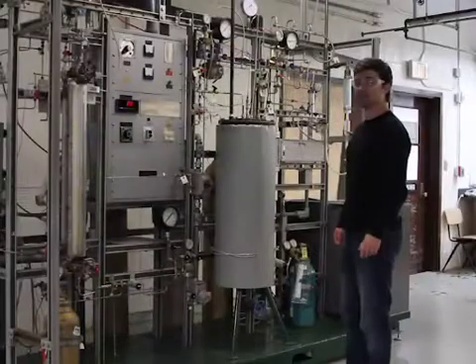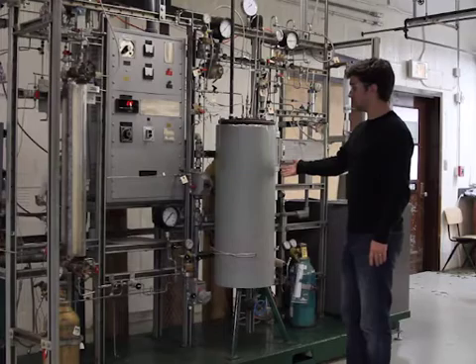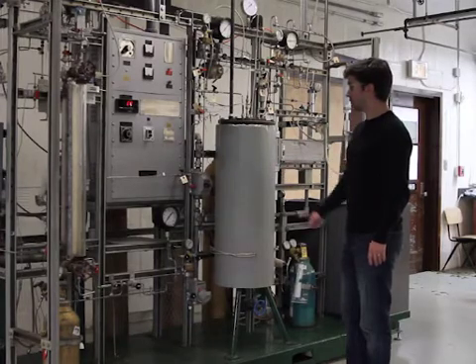Now that you know how a catalyst works at the atomic level, let's see how it is used in a pilot reactor setup.